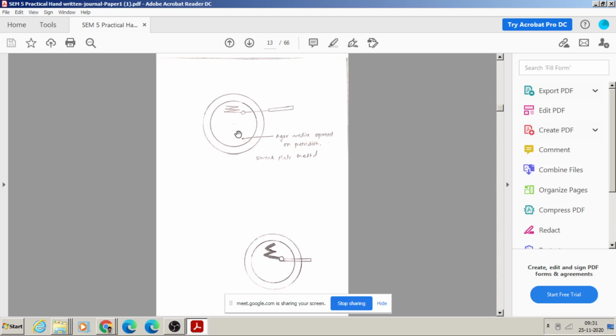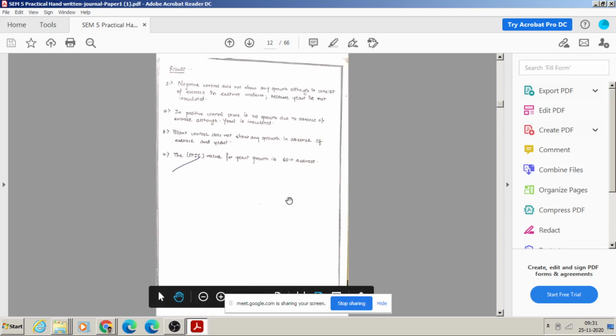On this you apply the streak, and the microorganism starts to show its presence after a few hours or a few days of inoculation. Here the microorganism starts to grow. This is how we can isolate them by means of the streak plate method. But there is another method in which the culture is poured and sprayed over the entire surface, which is called the petri plate pouring method. So the streak method and the pouring method are the two ways of isolation of the microorganism.